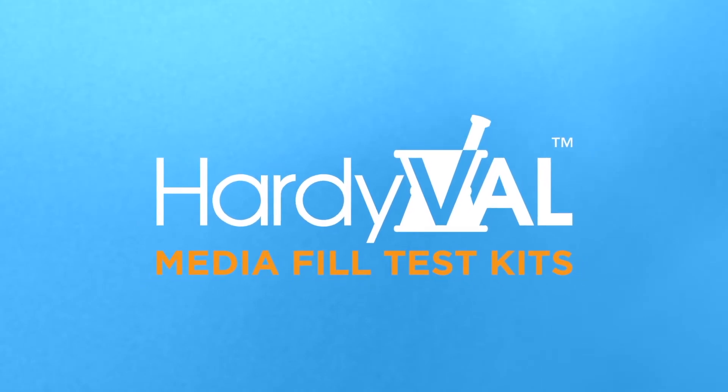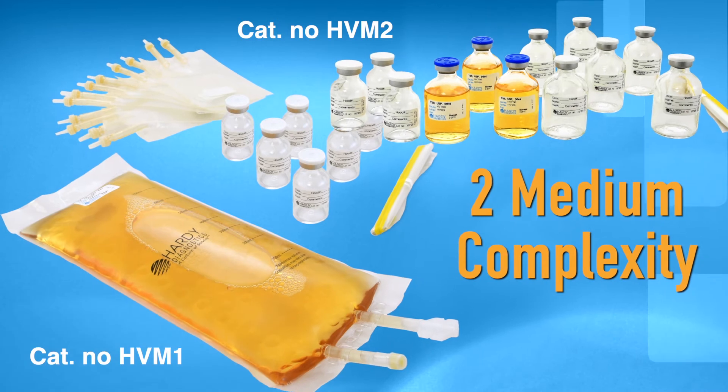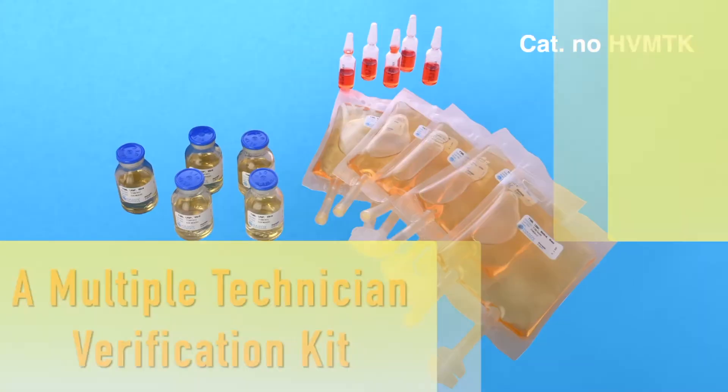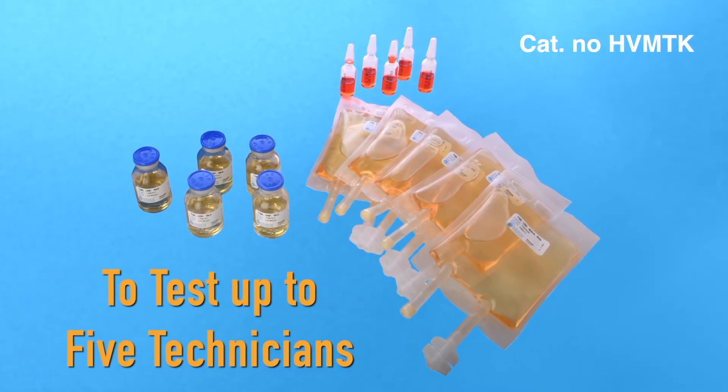Hardival kits are available in the following formats: low complexity, two medium complexity kits, high complexity, and a multi-technician verification kit to test up to five technicians.